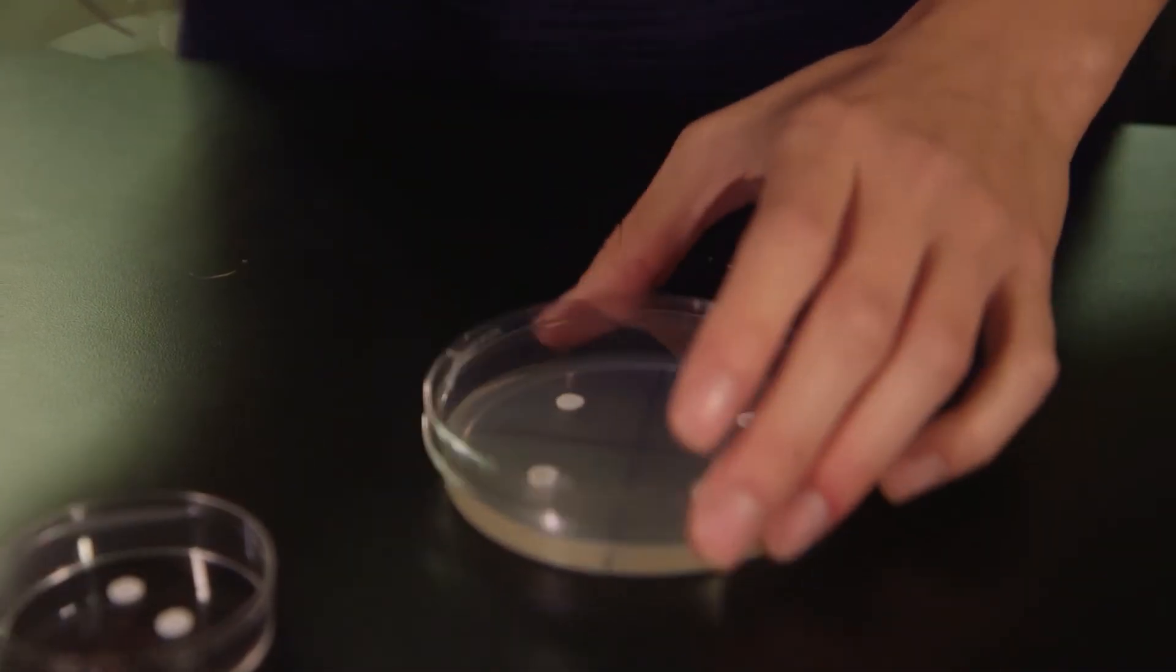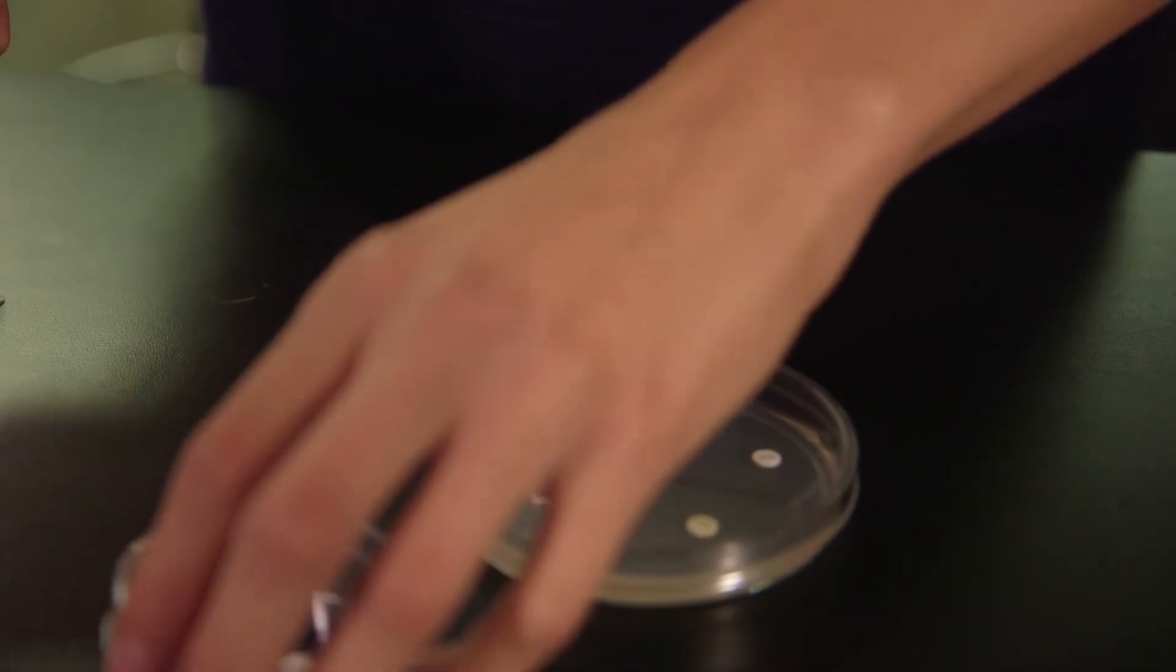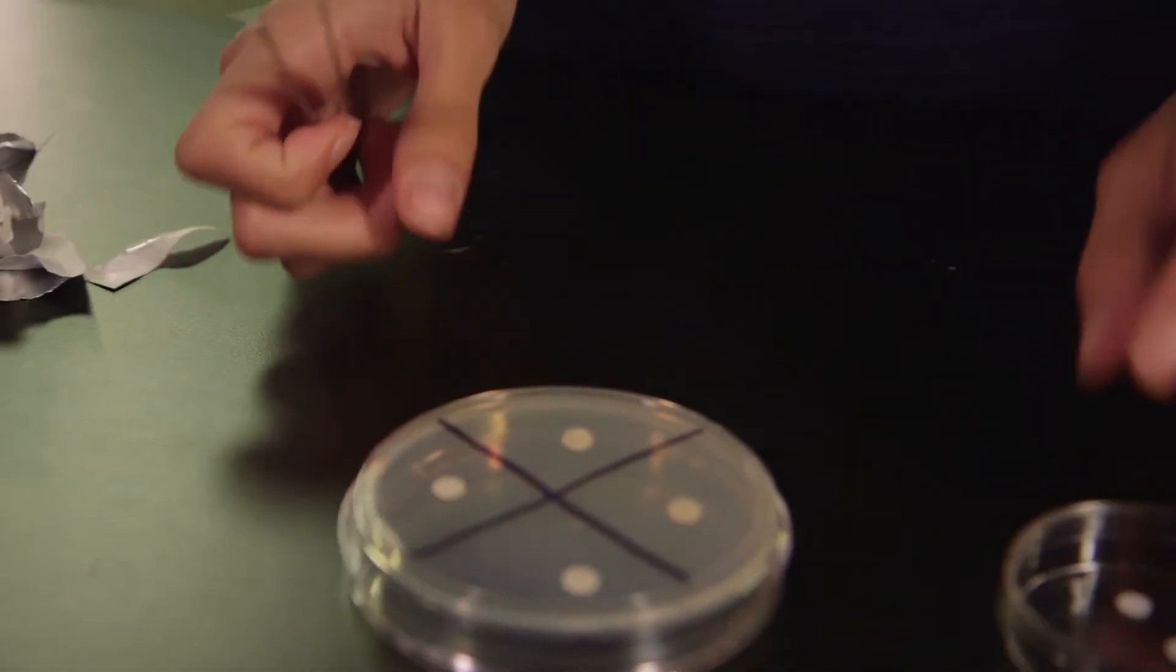We will incubate your plate at room temperature in an upside-down position. That is to say, with the agar surface on the top. This is to prevent condensation from the lid caused by the respiration of the bacteria from raining down on the agar surface and interfering with bacterial growth.